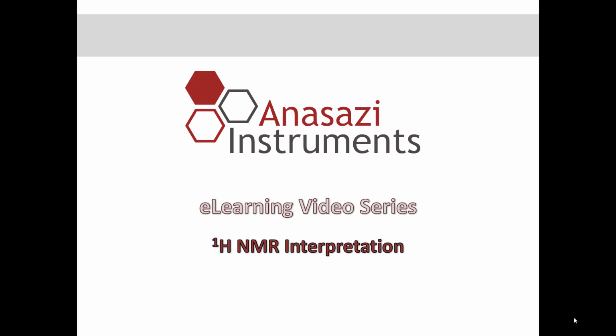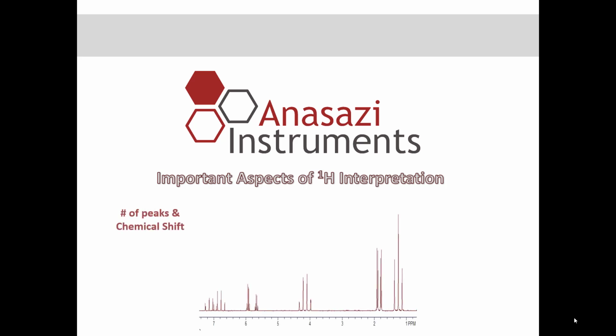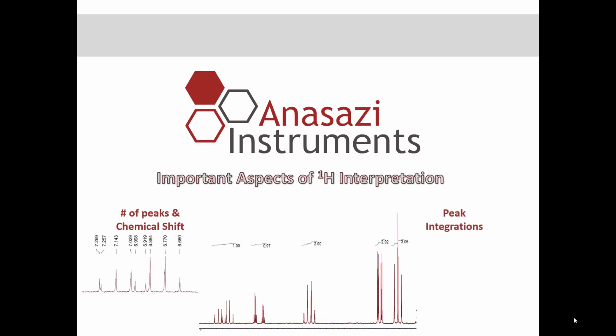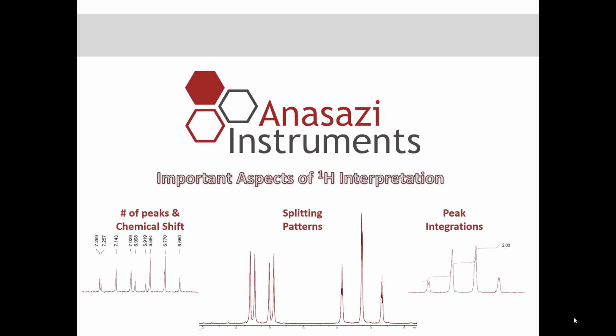Today's topic is interpretation of NMR spectra for proton. There are several important aspects when you're interpreting proton spectra. These include how many peaks are in the spectrum and their chemical shifts, how the different resonances integrate so we can get a ratio of one resonance to the others, and the splitting patterns that give us information about adjacent protons.